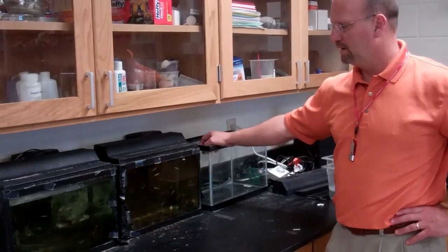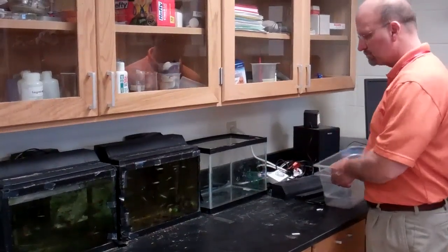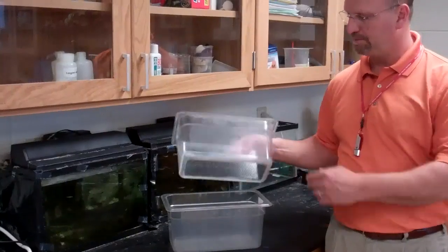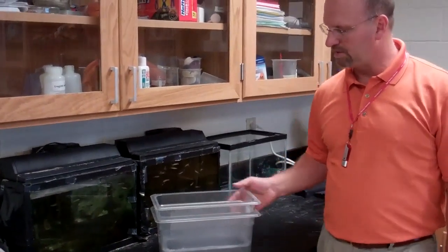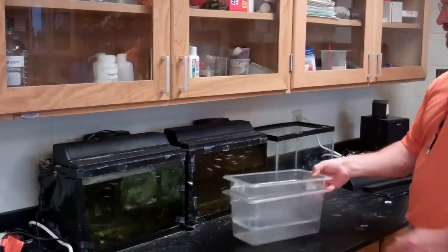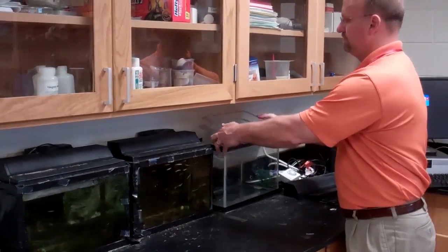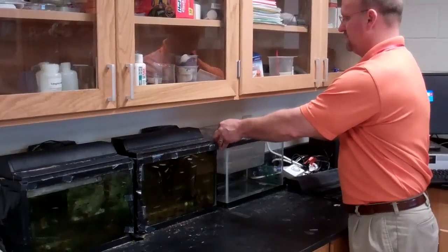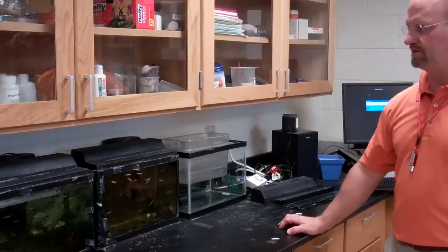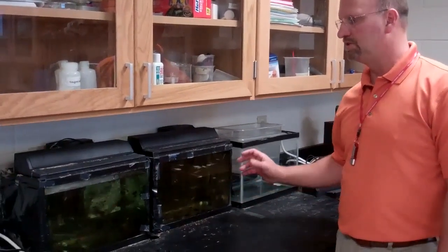and then get the fish ready for the breeding cycle. When I was ready to breed the fish, I'd take one of these breeding chambers, with the filter on the bottom, and pull the right ratio of males and females out. I'd put them in here the night before, and then insert them right into this tank. This tank is full of water, and the advantage is that the fish stay at the right temperature.